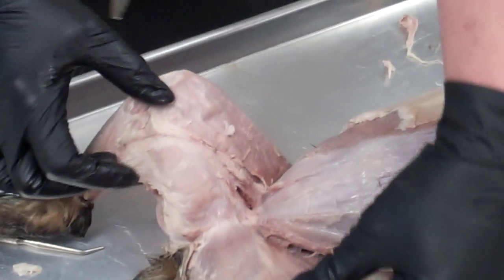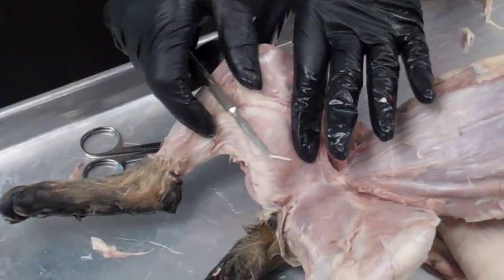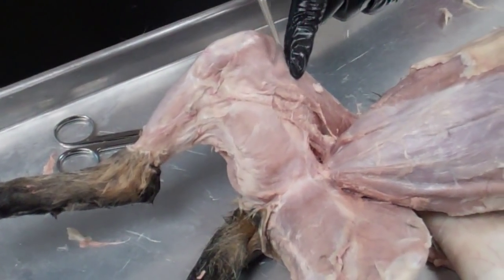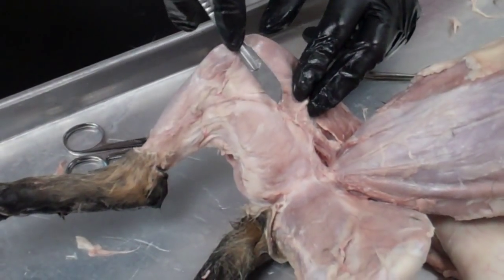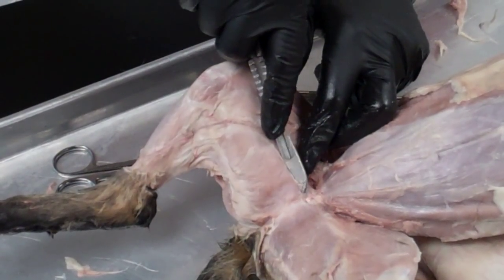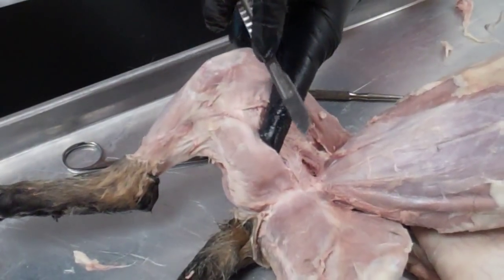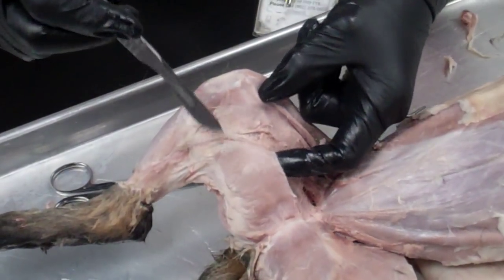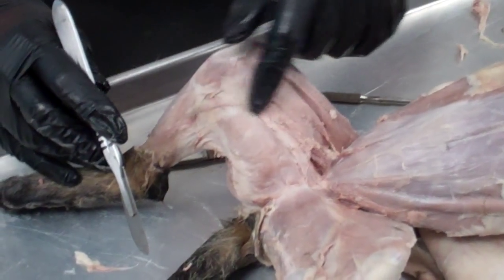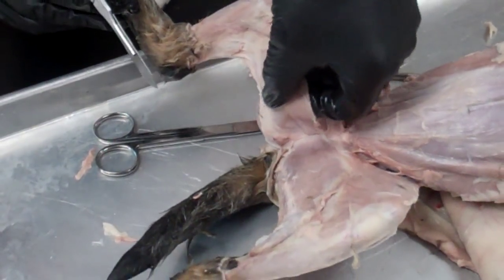Now we're going to find a muscle on the other side of the leg called the gracilis. It's similar in thickness to the sartorius. Push the material aside until you can see a natural separation — right along there is the natural separation for the gracilis. Then cut very shallow right at the natural separation line. This one is actually a little bit thicker than the sartorius. Keep the middle blood vessel intact if you can — hopefully in your cat this will be injected a little bit better.